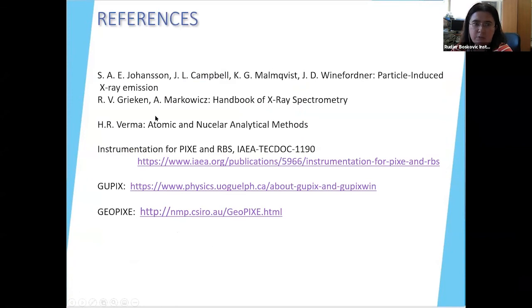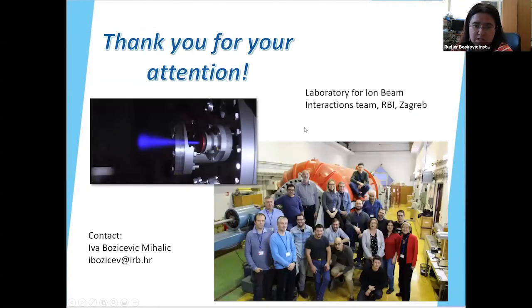Here I listed some references if somebody is interested to learn more about PIXE. Also, there is some instrumentation and documents that you can download from the IAEA webpage, and links to the software, which is not free, you have to pay. And this is basically it.